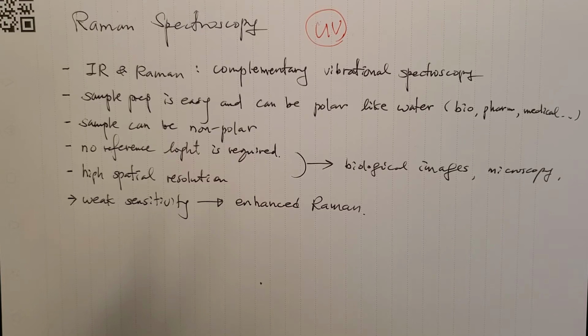However, Raman tends to have weak sensitivity because we are using scattered light, so-called Raman scattering. So you need to use enhanced Raman spectroscopy in a lot of cases.